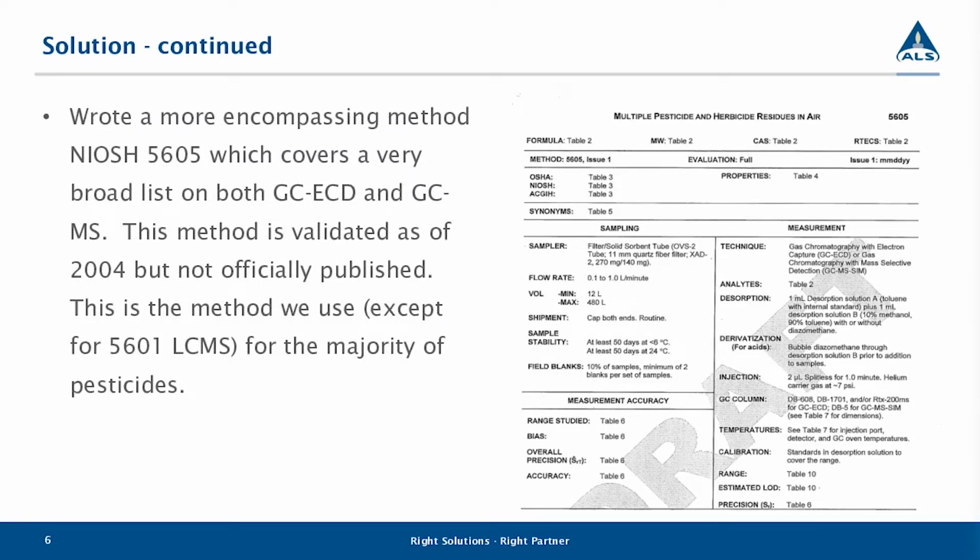So this method has been validated by NIOSH. They do validation studies, but as of today, it has not been officially published. NIOSH only releases publications every so often. So this method, unlike the others mentioned, is not available to the public online. We have a copy of the draft form of it because we wrote it, and we are running it, and we are certified to run it. But if you are trying to access it online, that's why you can't find it.